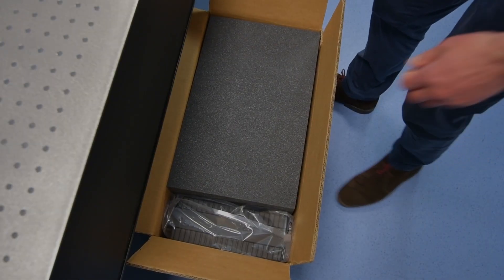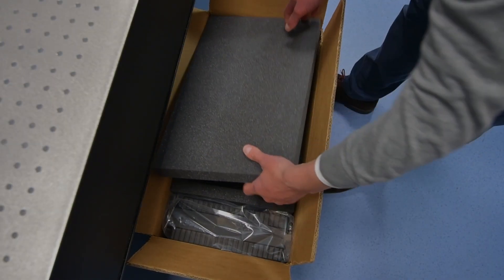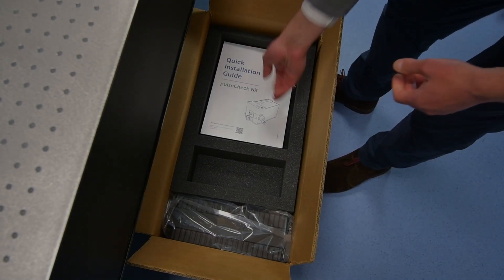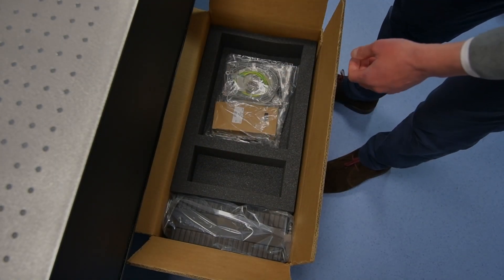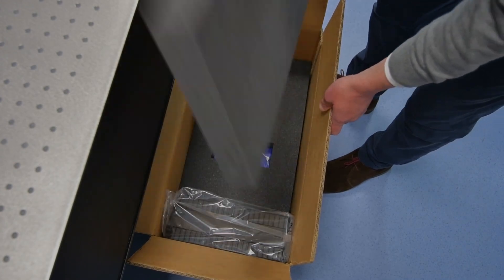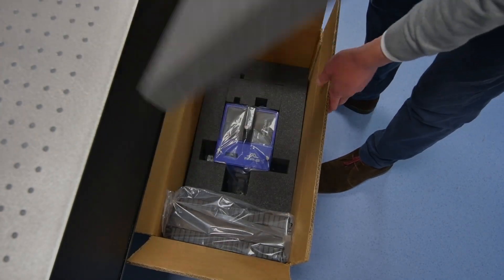This is the shipment box of PulseCheck in X. Make sure the box and its contents have time to reach room temperature to avoid condensation inside the device.